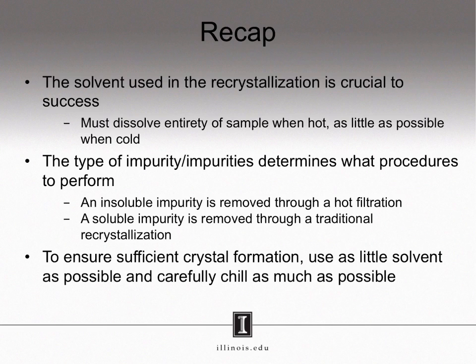To ensure sufficient crystal formation, you should use as little solvent as possible to dissolve the entirety of your compound when it's hot, and then carefully chill your solution as much as possible in order to minimize the solubility of your compound in the solvent.